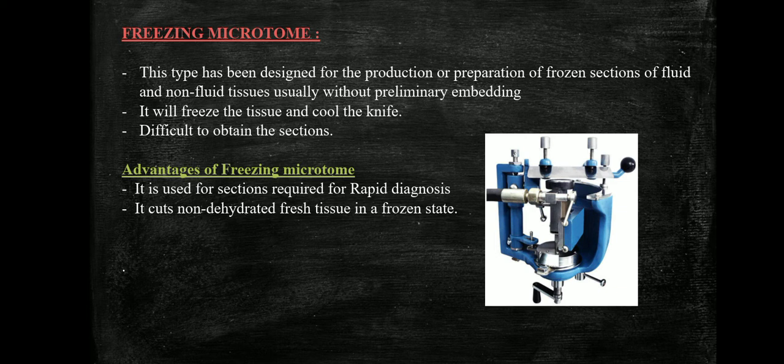An advantage of freezing microtome is it is used for sections required for rapid diagnosis. It cuts non-dehydrated fresh tissue in a frozen state. This diagram represents the freezing microtome.